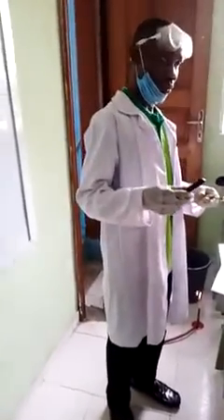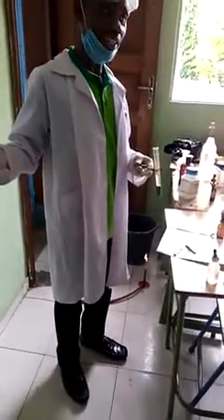Can you see that? So don't switch off yet. So what will now be your inference? NH3 is present. If you want to test further, you can dip a glass rod in conc HCl and then place it at the tip of this test tube.